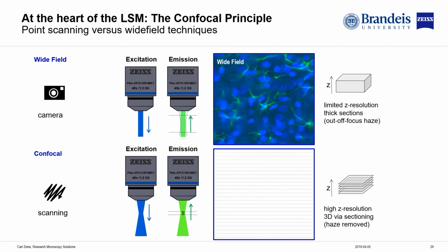So to kick this off, I figured the easiest thing to do would be to give a little bit of theory behind the Airyscan, how it's working and why it's working the way it does. We did a little bit of this yesterday as we were talking about hardware setup. So I'm going to maybe skip through the first couple slides fairly quickly, but it's still a good grounding and a good place to begin by thinking about why we're doing confocal in the first place, and then the losses that you get by imaging with confocal and what we can do to try to mitigate that.